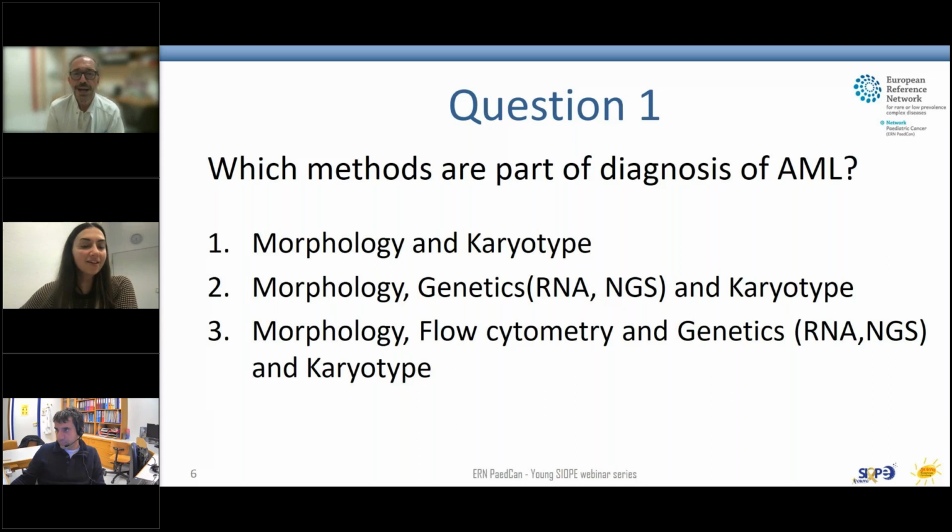I'd like to comment because flow cytometry is one of the mainstays of my interest. It's definitely so that we need flow cytometry to describe the megakaryocytic leukemia, because this leukemia is defined by flow cytometry only. There are hints from morphology, but the expression of certain markers like CD41 or 61 or 42 is actually making the diagnosis of M7 FAB.